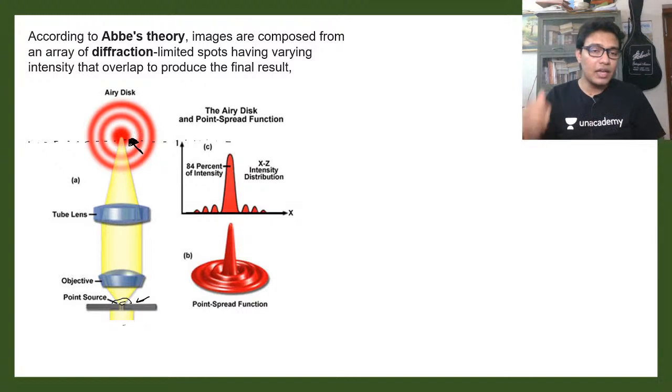So in the back focus, what you can see, this point is now not appearing as a point. So it's a point source, right? So we started with a point source, but now this point is not behaving like a point. This point has spread a little bit. So this is due to a little bit of aberration in your microscope optics system. But overall, it's like a point, right? So this function, which basically defines how much a point would be spread, is known as the point spread function. It also tells you how accurate your microscope is, whether it is free from any kind of optical aberration or anything, right? And you would definitely like a microscope which would not have any optical aberration.